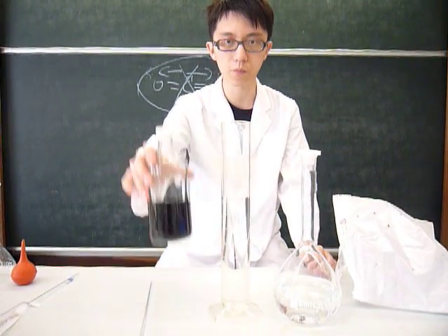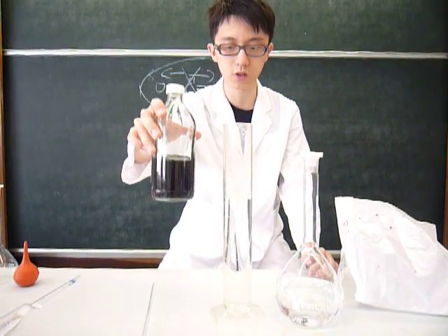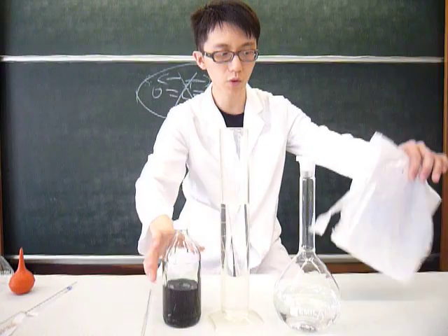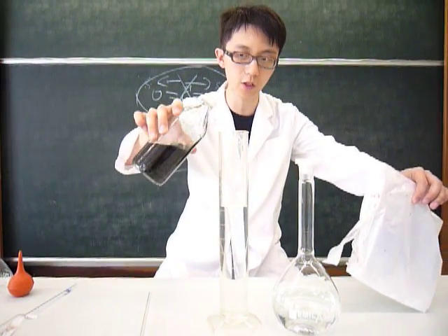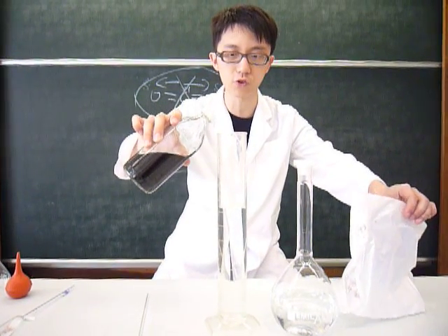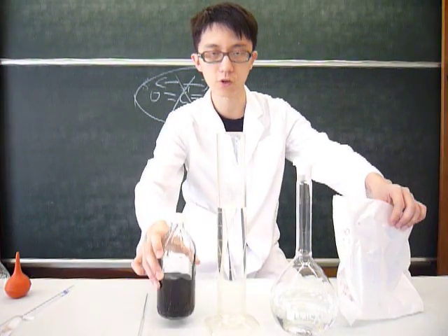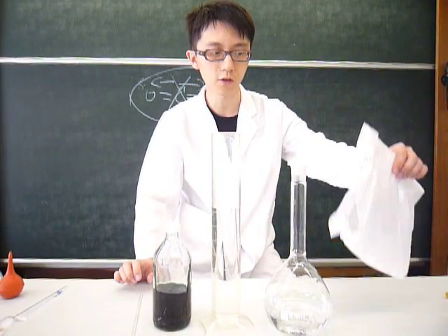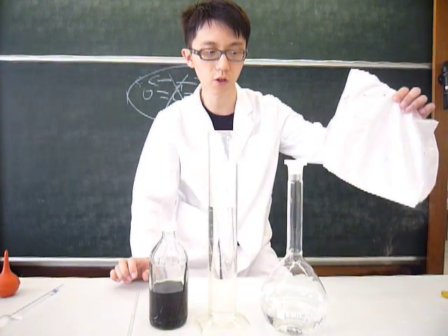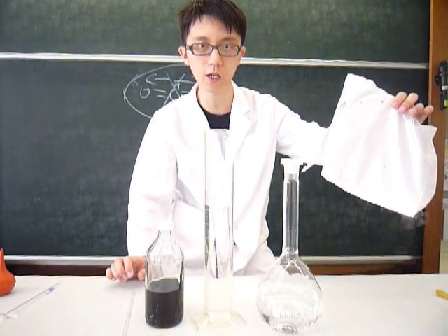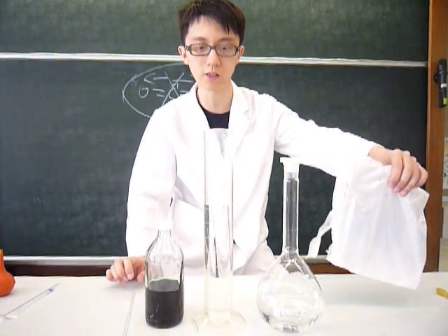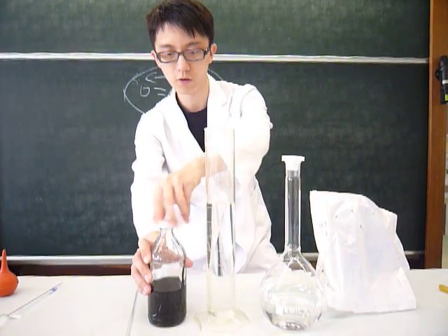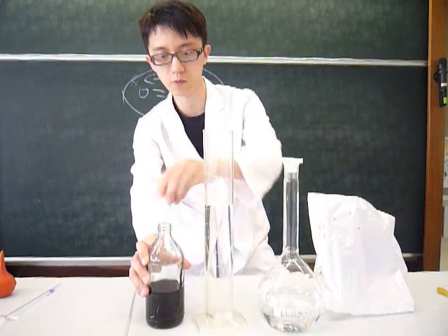This is the pH indicators, and we will put the pH indicators into the diluted sodium hydroxide solution. Then we will try to put some dry ice into it and see what happens. So let's start the experiment.